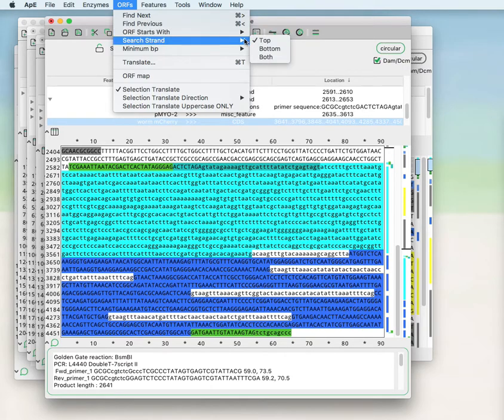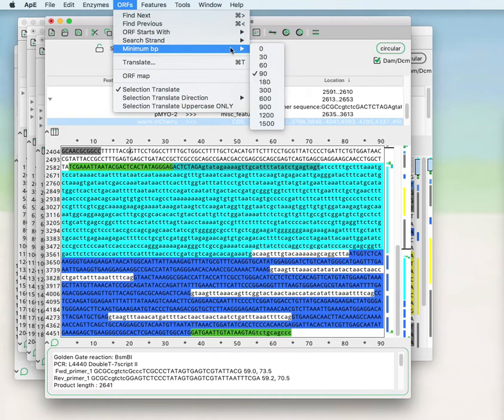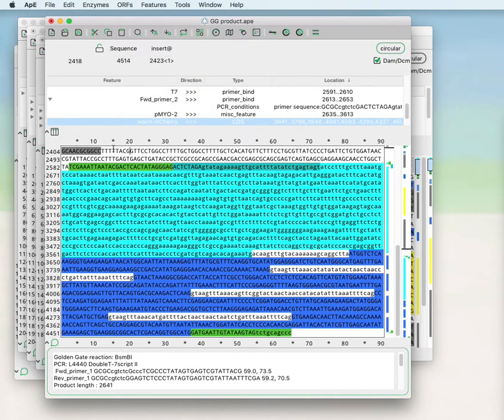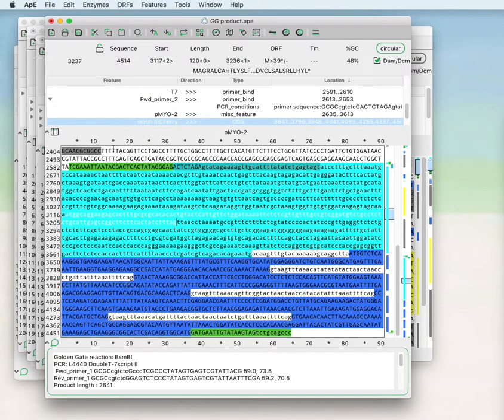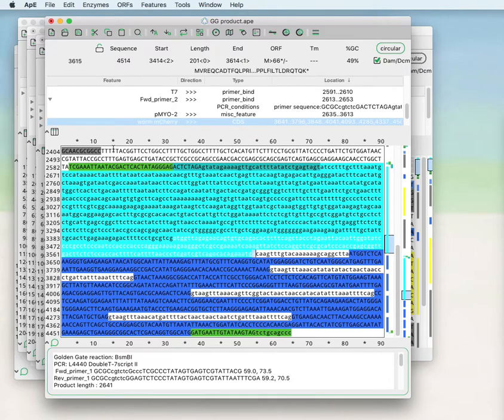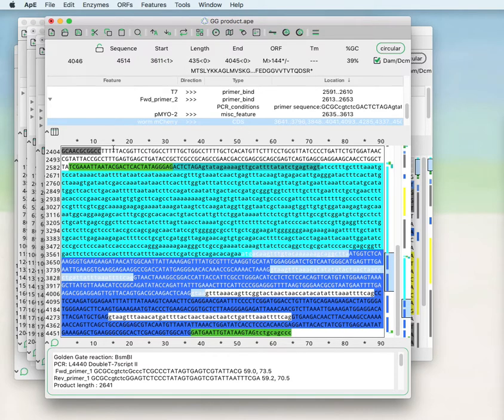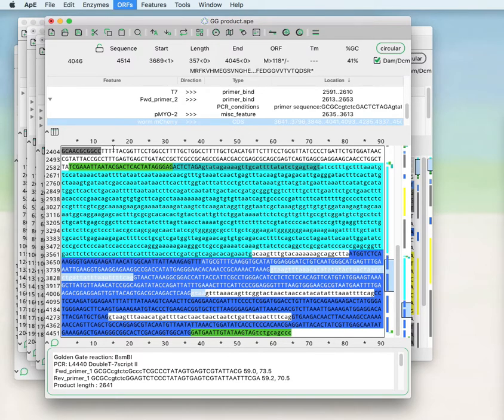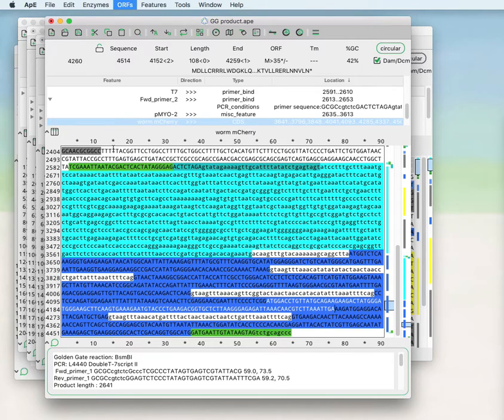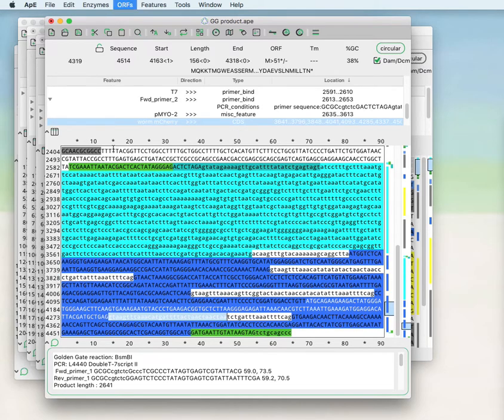You can search the top, the bottom, or both strands, and set the minimum base pairs that the open reading frame has to have before it will stop at that location. If you use that repeatedly, you can find any number of open reading frames within your sequence.